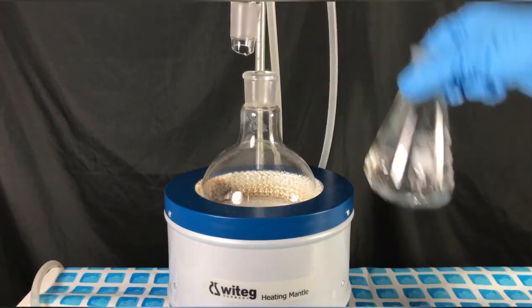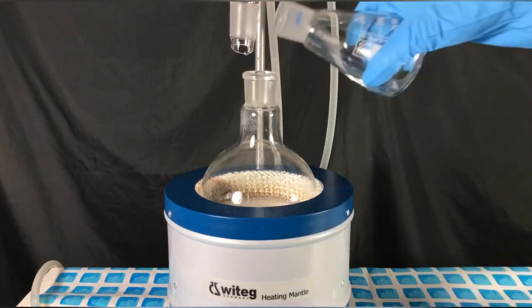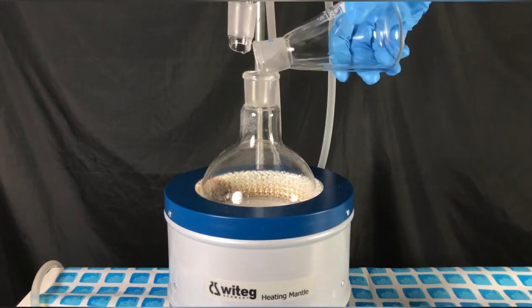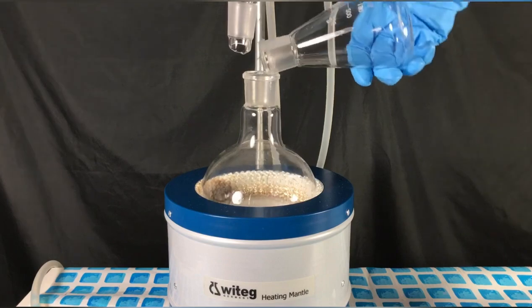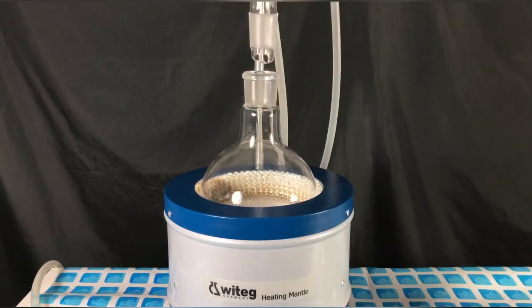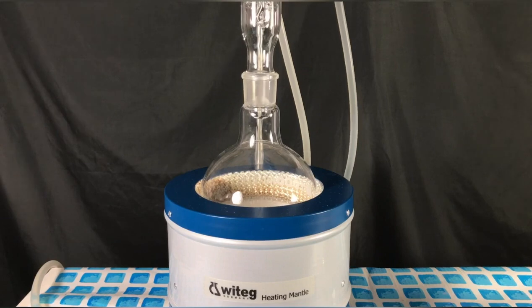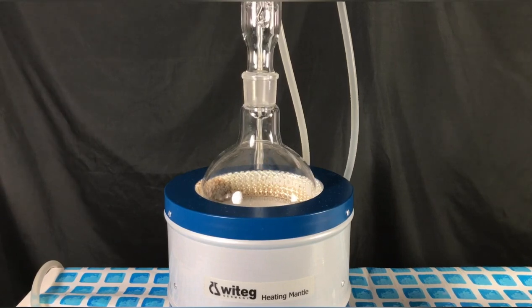The flask was swelled with a small amount of ethanol, which was later also added to the reaction. This allowed us to transfer the urea that had crystallized on the walls into the reaction flask. The reflux condenser was then lowered down.